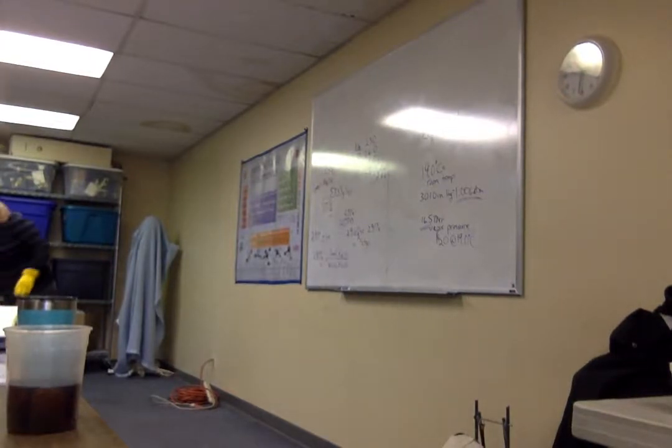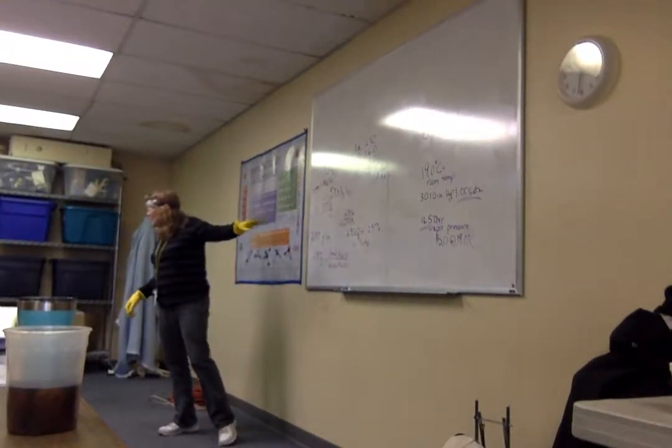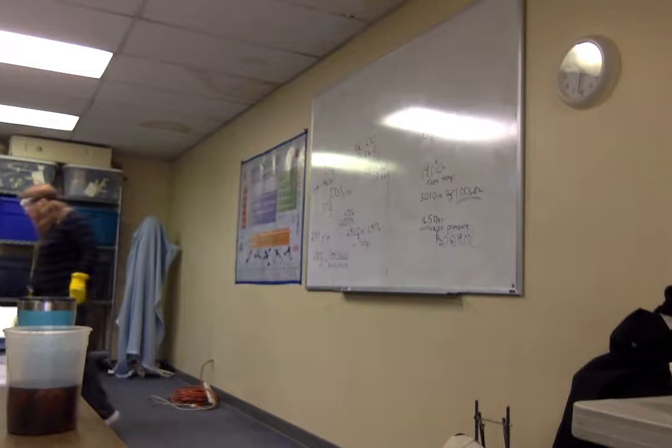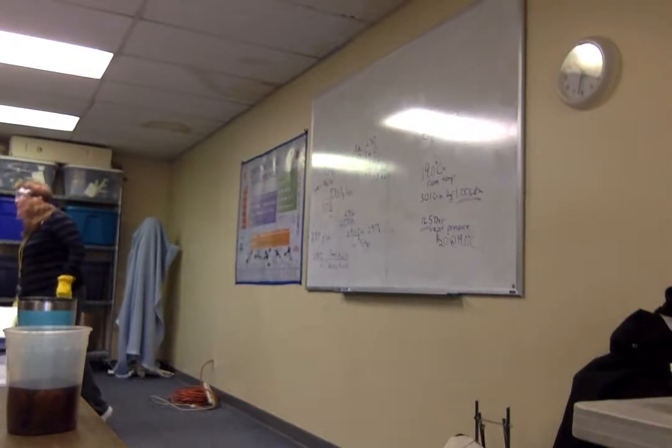So the student who's absent, say hi, Caroline. I made this thing, I did this for you. Okay, so 175.0 grams is the amount of lye. I don't know if she can see that. Should I move it over there?